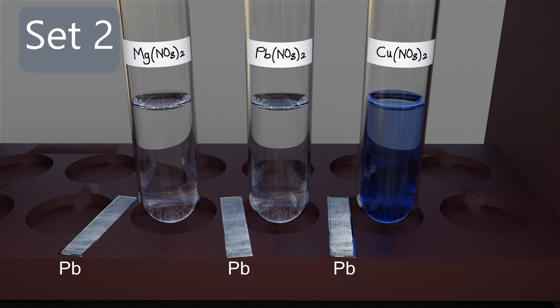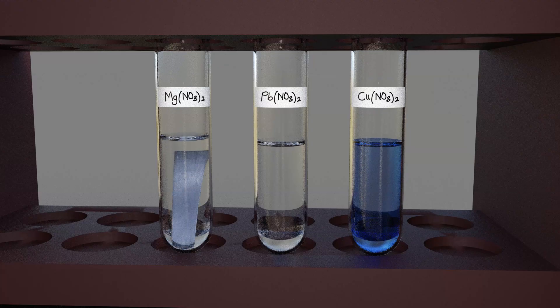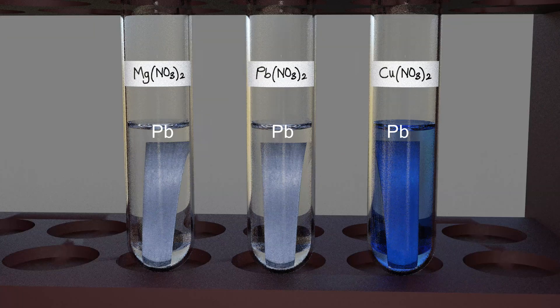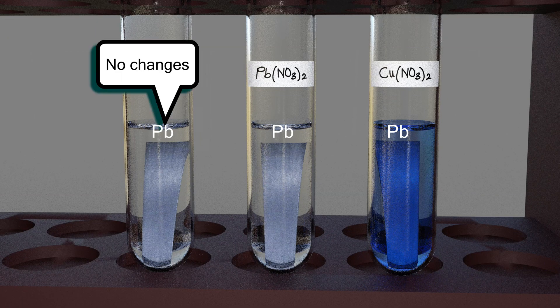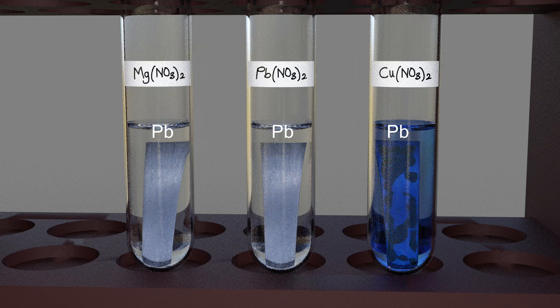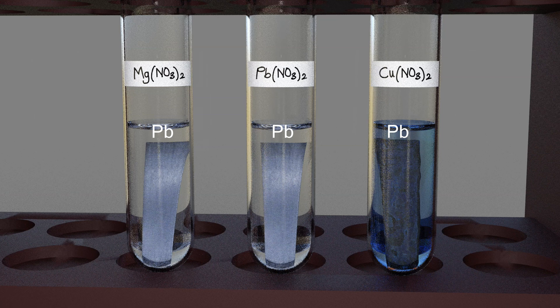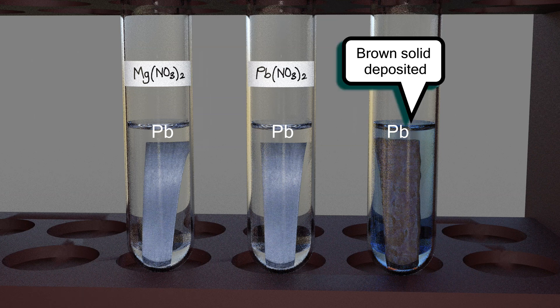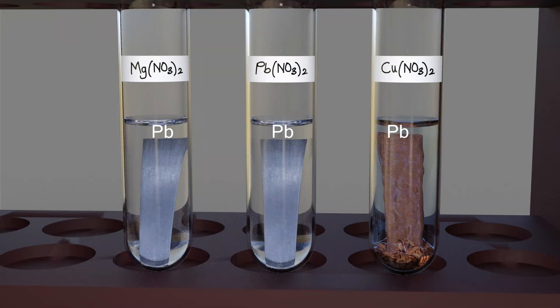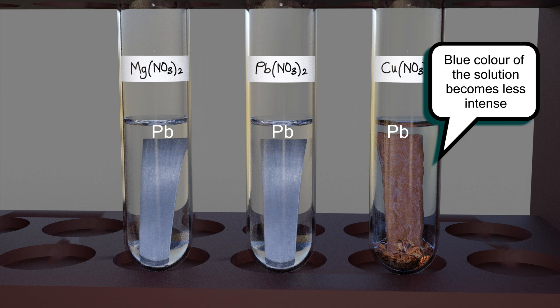Prepare three strips of lead and insert a lead strip into each of the three test tubes of set two, and observe. No changes can be seen in the test tubes containing magnesium nitrate solution and lead two nitrate solution. However, a brown deposit, which is copper metal, can be seen forming in the test tube containing copper two nitrate solution. At the end of the reaction, the blue color of the copper two nitrate solution becomes less intense.